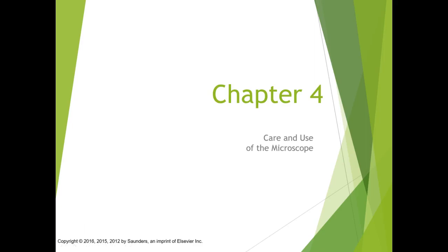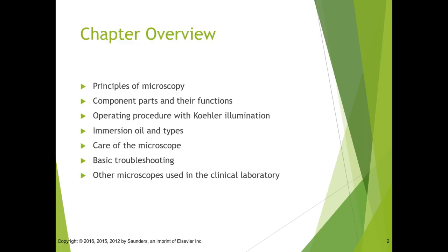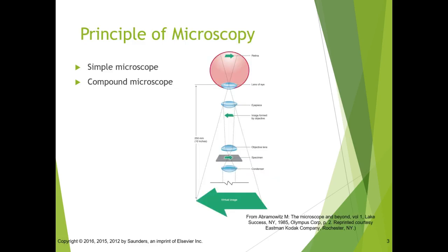Chapter 4, Care and Use of the Microscope. So today we're going to talk about the principles of microscopy and the different types of microscopes that there are, how to care for the microscope, how to troubleshoot the microscope, and a little bit about the other types of microscopes that might be used in the lab.